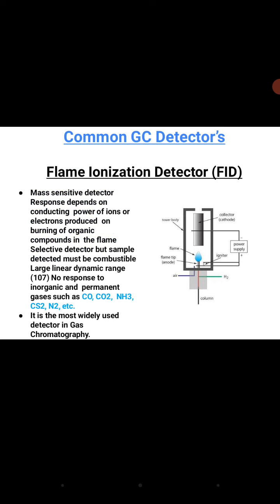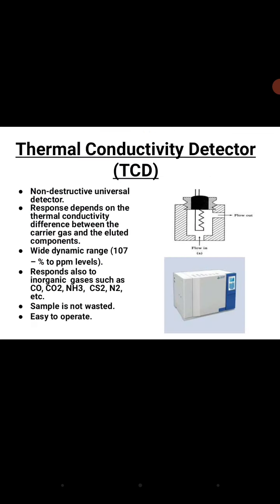Flame ionization detector, FID. Mass sensitive detector, response depends on the conducting power of ions or electrons produced on burning of organic compounds in the flame. Selective detector, but the sample detected must be combustible, large linear dynamic range, no response to inorganic and permanent gases such as CO, CO2, NH3, CS2, N2, etc. It is the most widely used detector in gas chromatography.